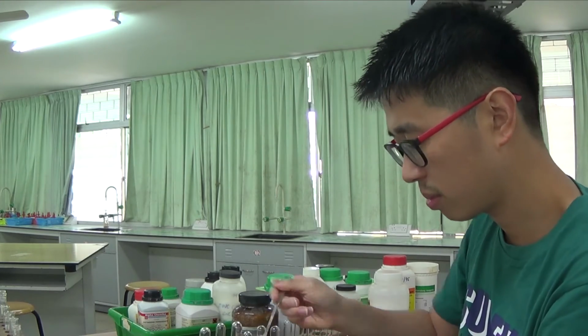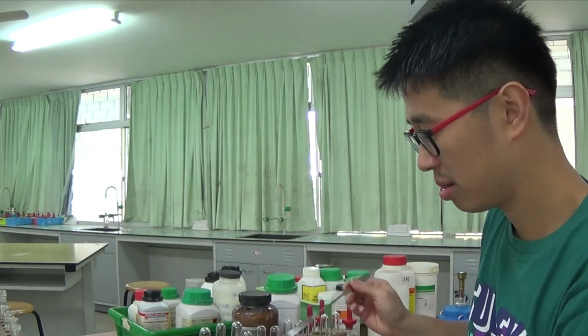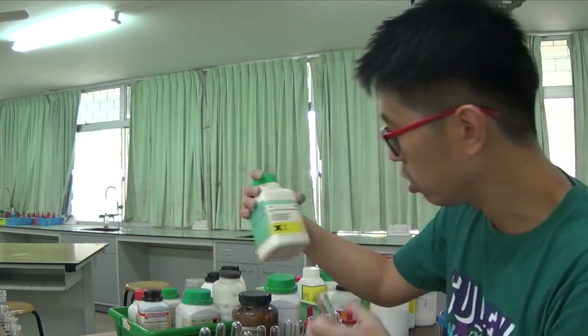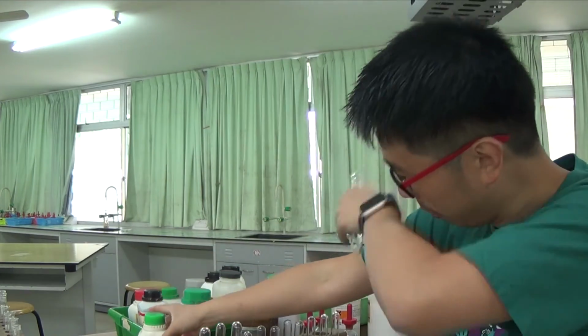Alright, so I think I dissolved enough of the solid. I think it should be alright. Okay. So this is ammonium iron(II) sulfate. I'm going to make a solution of this.